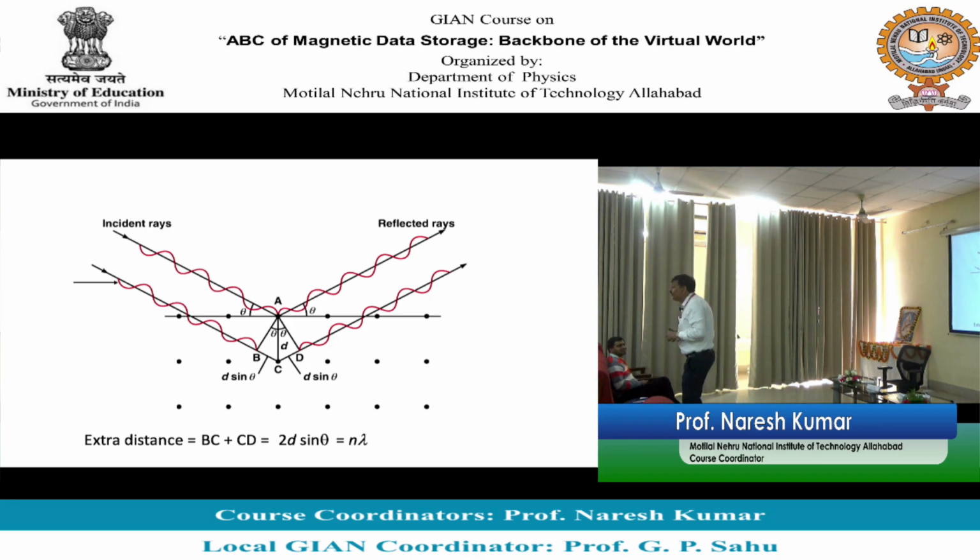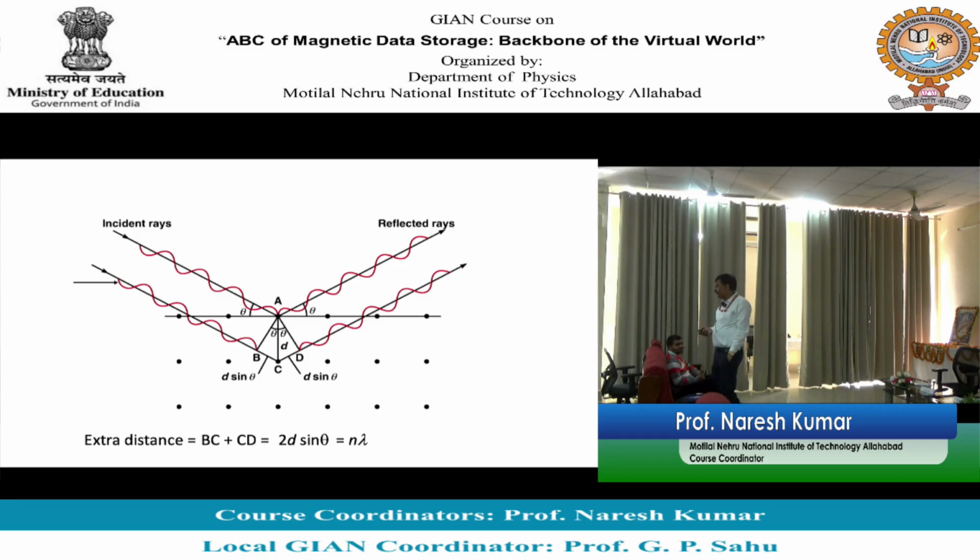मतलब क्या है इसका? फर्स्ट सेकंड समझ में आ रहा है, but what do you mean by that? How you feel about it? दूसरी लेयर से आ रहा है, मतलब 1 मतलब पहली लेयर से, 2 मतलब सेकंड लेयर से, ऐसा कुछ है. If you take one more layer, then it will be n is equal to 3. Am I right?